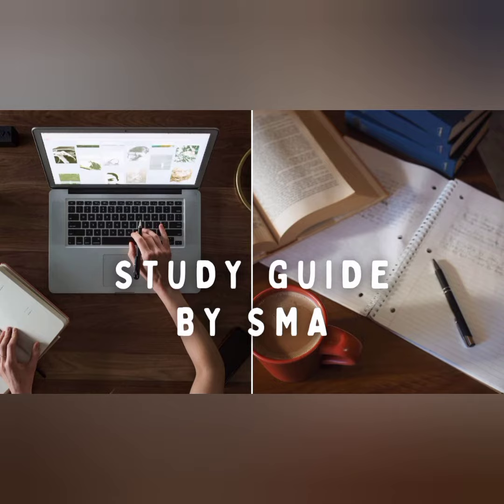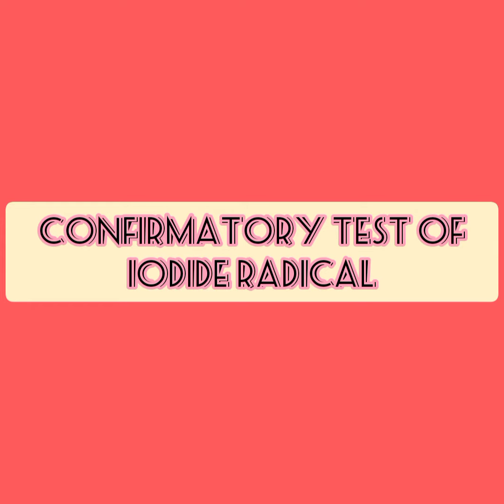Today I'm here with another very important video for all my students who are going to appear in the practical exams, and the topic of the video is the confirmatory test of iodide radical. As you all know, iodide radical basically belongs to the concentrated acid group. I have already uploaded a detailed video on the identification and confirmation of iodide radical.